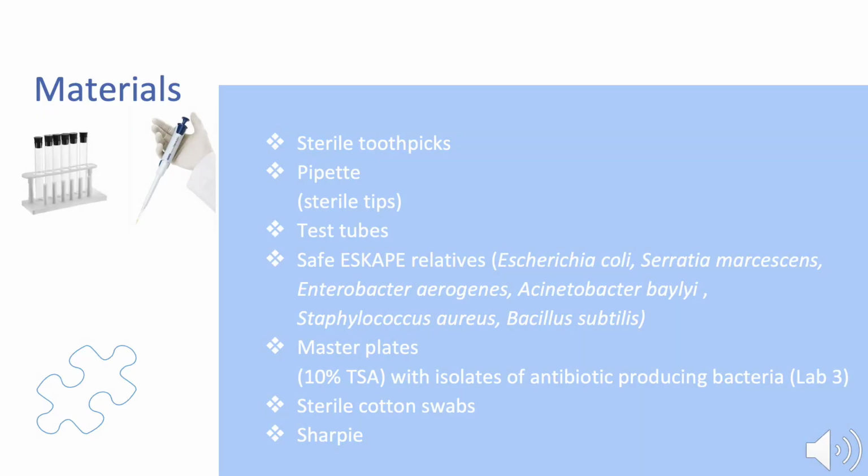Here is a list of materials for the Antibiosis Lab. All of the materials will be used and are important for the execution of the lab procedure.